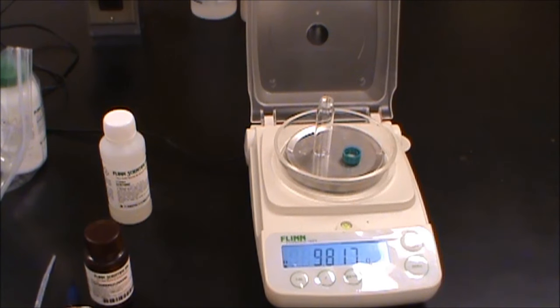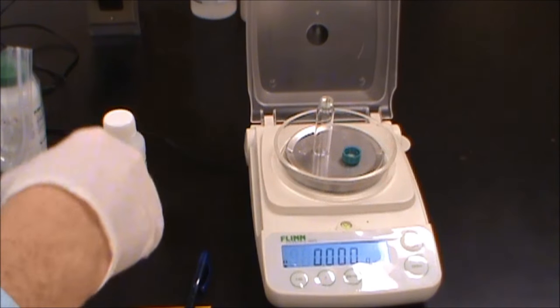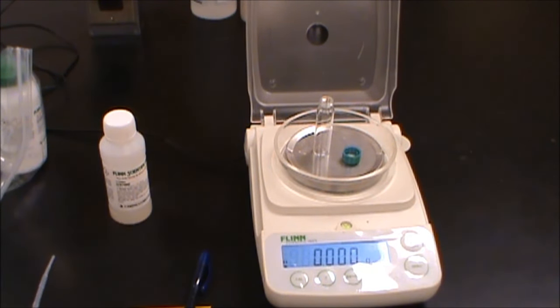First I'm going to write down the mass of my cap and vial which is 9.816 grams in case that comes in handy later. I'm going to zero that and I'm going to add some O-nitrobenzaldehyde to it. I want to add about 0.3 grams.